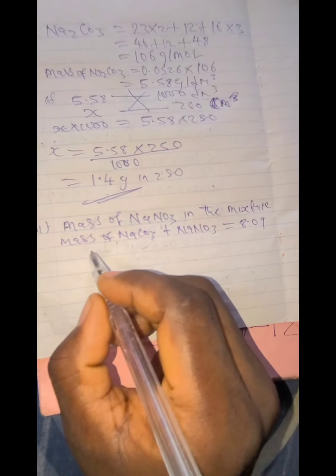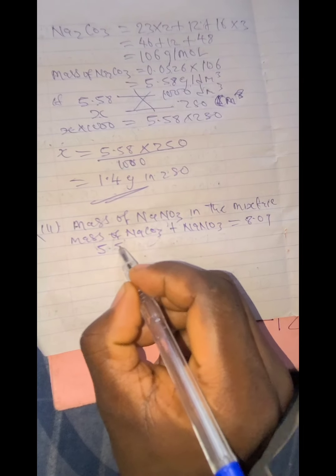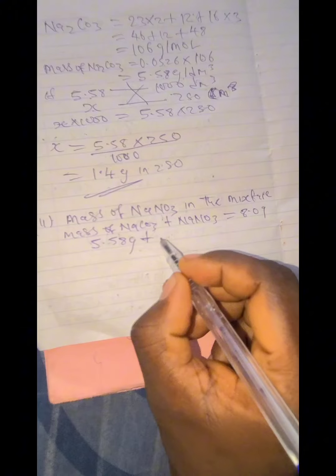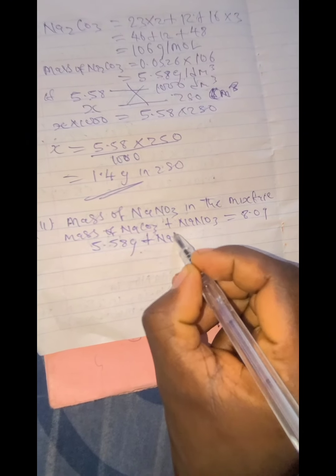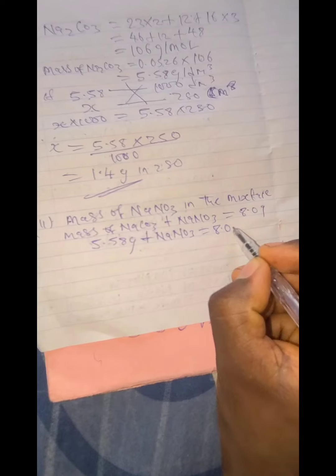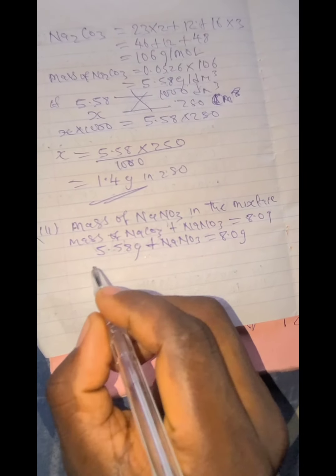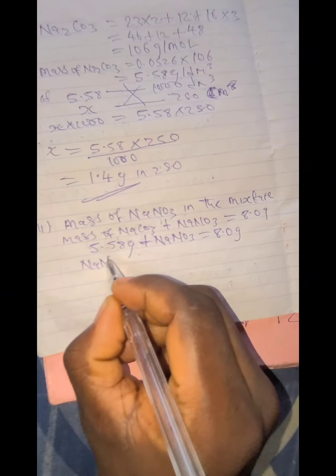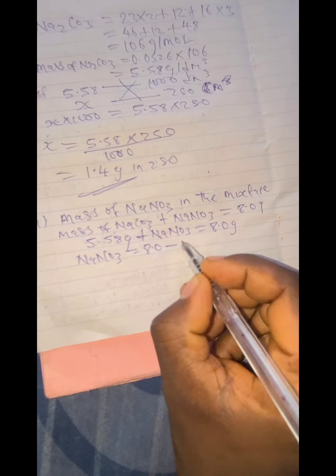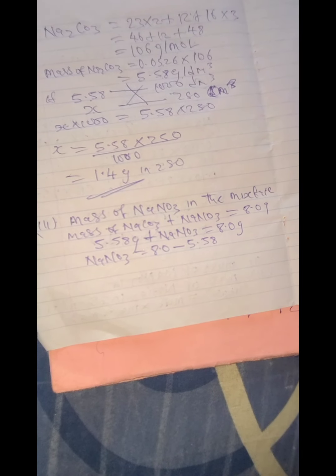So we now say 5.58 gram plus the mass of sodium trioxonitrate equals 8.0 gram. Then collect like terms, NaNO3 will be equals to 8.0 minus 5.58. So minus it.